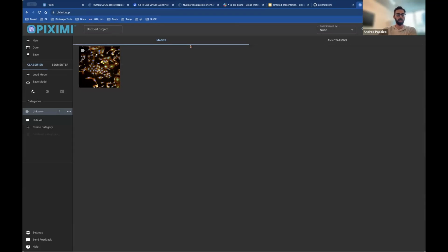If you have extremely large images and very many of them, it's not going to run as quickly on your local MacBook or whatever computer you're using, if you don't have the processing power. Eventually, we would like to build it out so that you could send off these images. You can specify your own backend to do these calculations on. But currently, it's limited by whatever computer you're currently using.